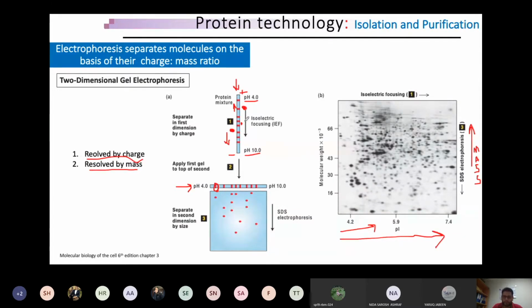because sometimes I create confusion when I try to. So if this is a negatively charged protein, then these are positively charged, highest molecular weight protein. These are the highest molecular weight proteins present at this corner with maybe negatively charged fractions, because we have said it's a less pH, so it seems it's negatively charged. And then there are proteins with lower molecular weight, and these are positively charged, and there are proteins in between them. So you see, the majority of the proteins remained at the center.